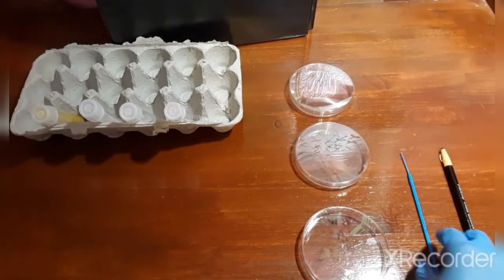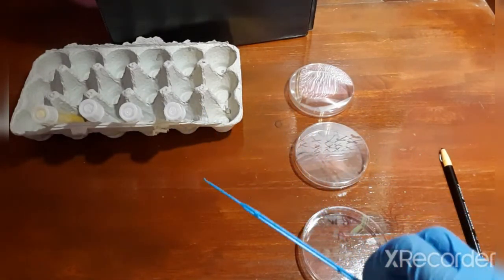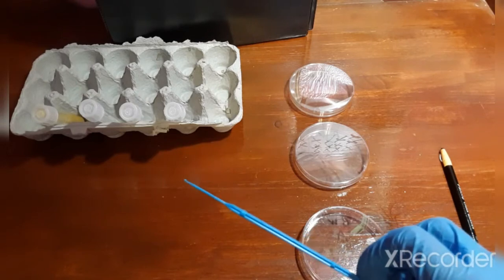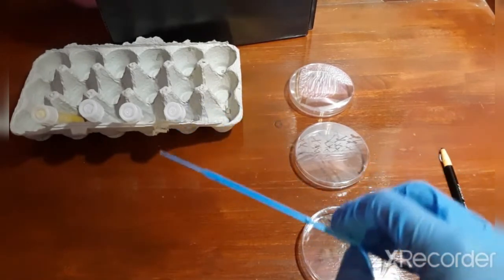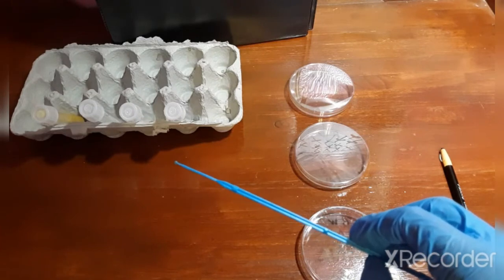Now, in this experiment I will be using a plastic inoculating loop, but if this was a real experiment, I would check my inoculating loop before I begin. In a real experiment, your loop shouldn't be more than about three millimeters in diameter, and it would be completely closed so that a film could form in the loop itself.